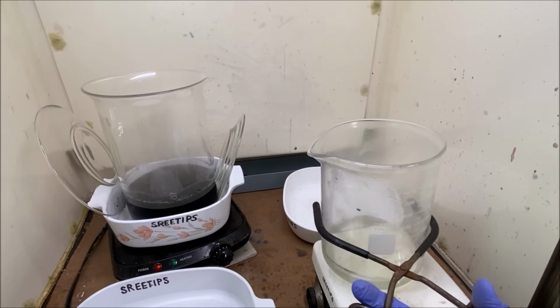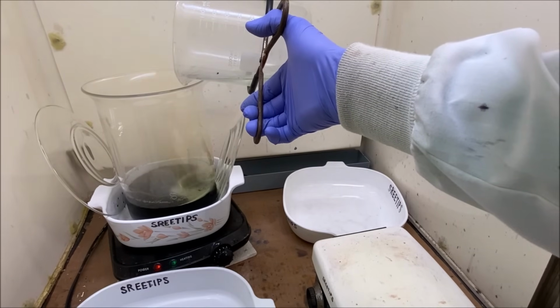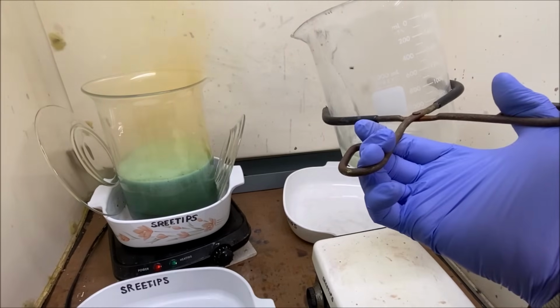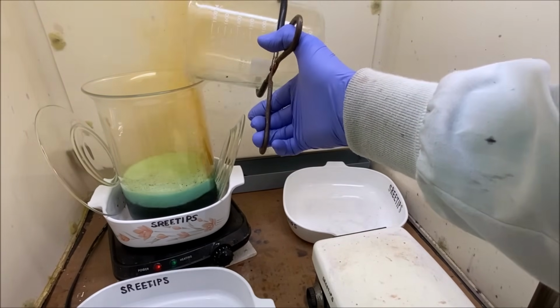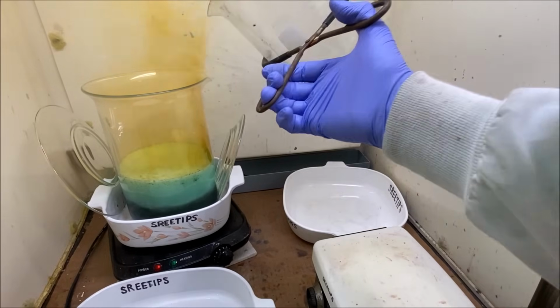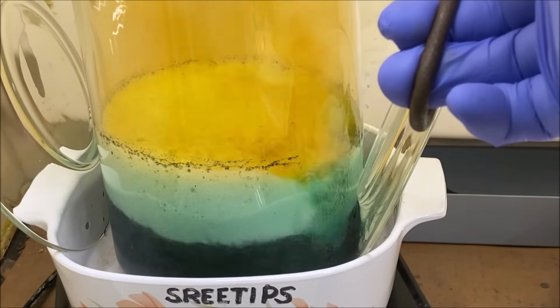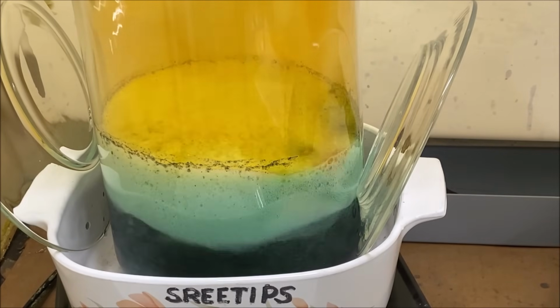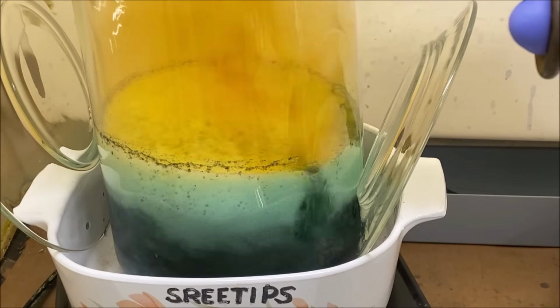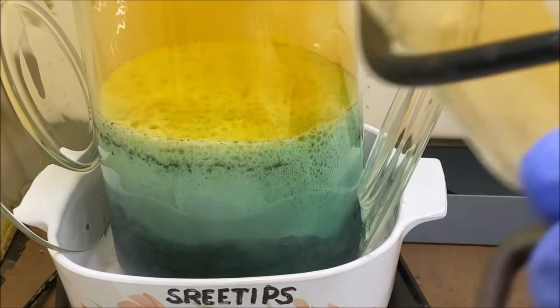Let's pour this nitric in real quick, very slowly. It's real hot down in there, so it'll react very fast. I gotta watch how I add this. Okay, now I'll get this beaker back.